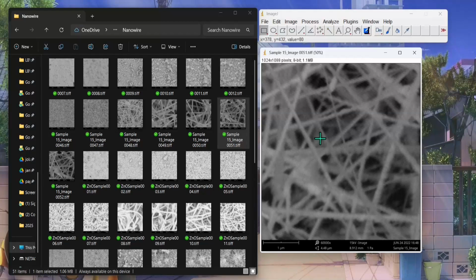Okay, so you have opened an SEM micrograph of zinc oxide nanowires in ImageJ, and you want to measure the diameter of the wires. It seems that you have the image open, and now we're asking how to use the tool for measurements. Is that correct? Yes, please proceed.